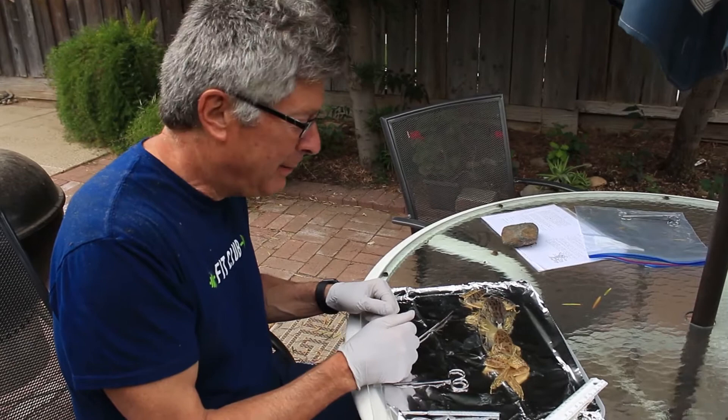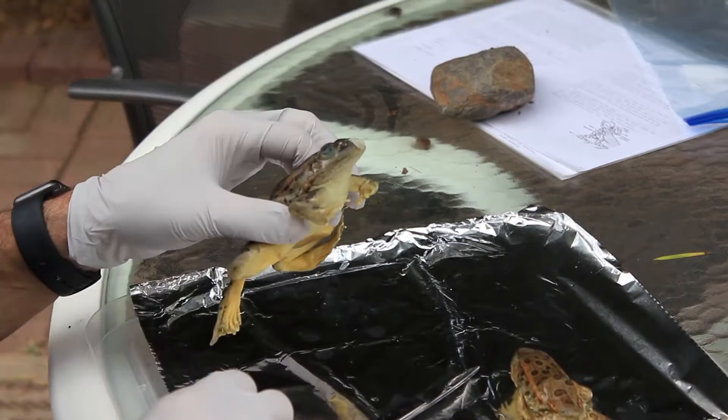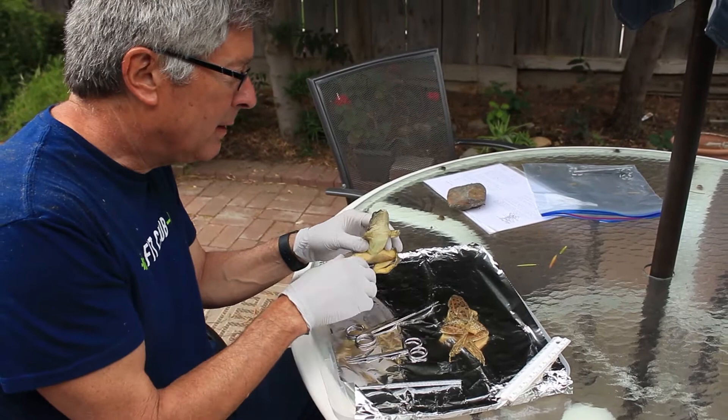Hello boys and girls. Today we're going to do a frog dissection. I'm Mr. Ferrante — if you don't remember who I am, it's been a long time. So we have two frogs here. I haven't named them yet. Frogs are carnivores, which means they eat meat. They're also called amphibians because they live half their life in the water and half on land.